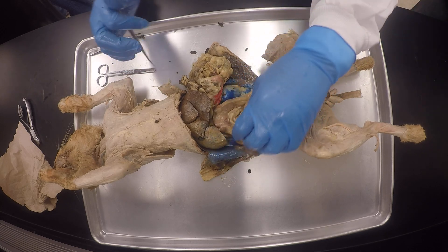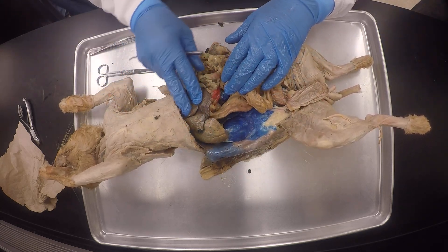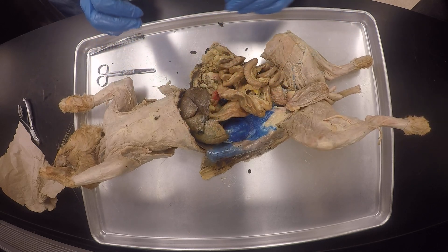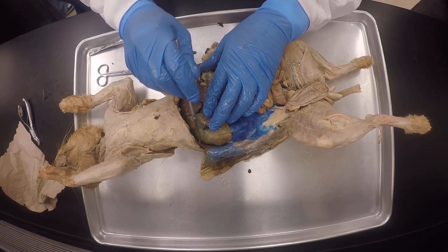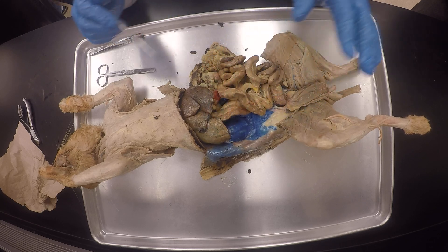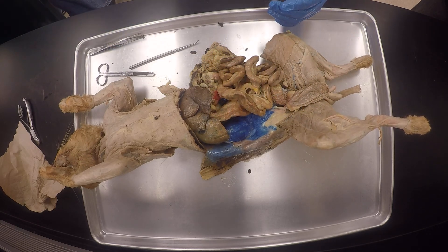We've done the regions of the stomach, the lesser and greater omentum, the liver lobes, the pancreas, and the digestive system overall. The respiratory system starts with the diaphragm. We're going to shut down this video — can you do this now?